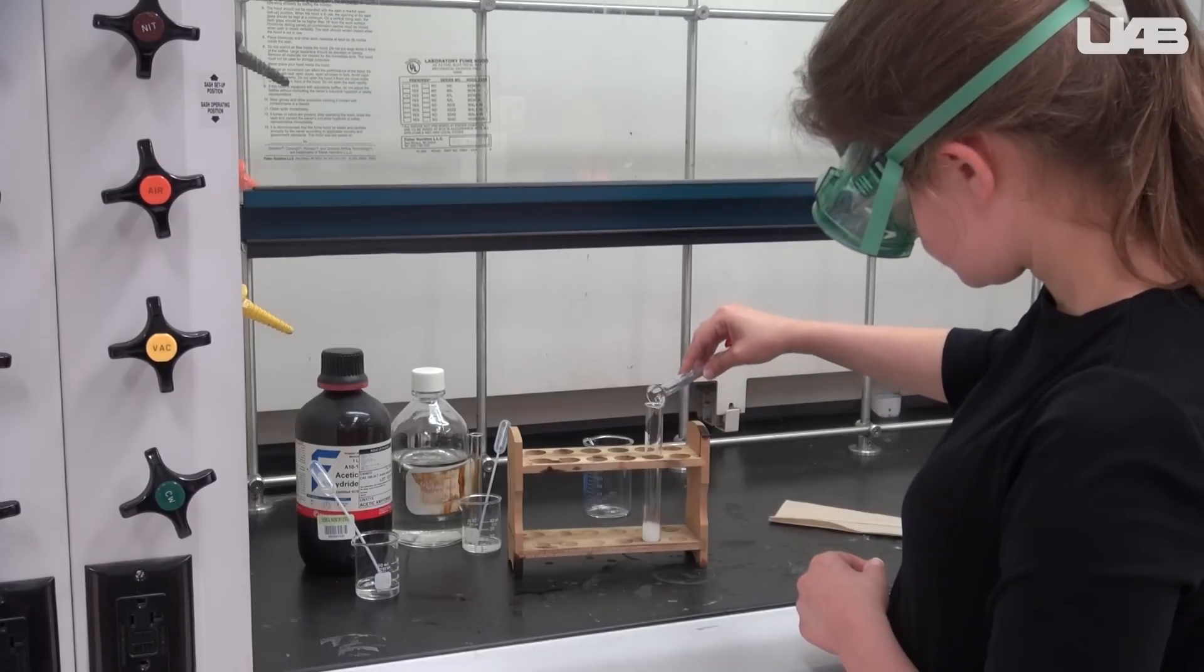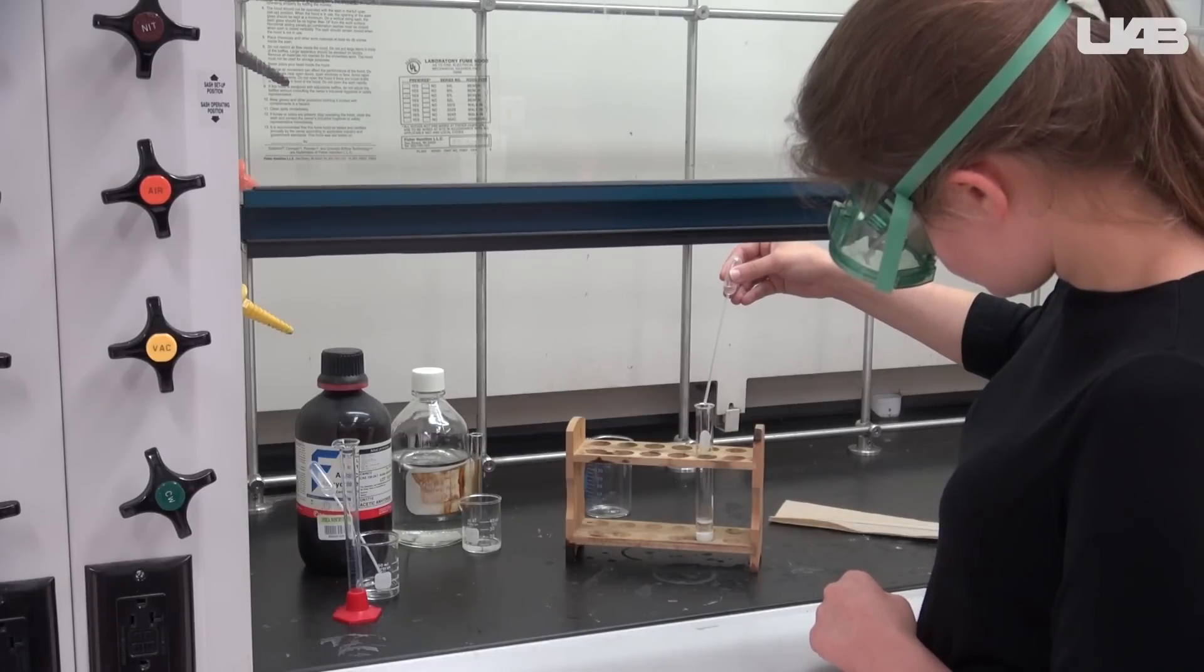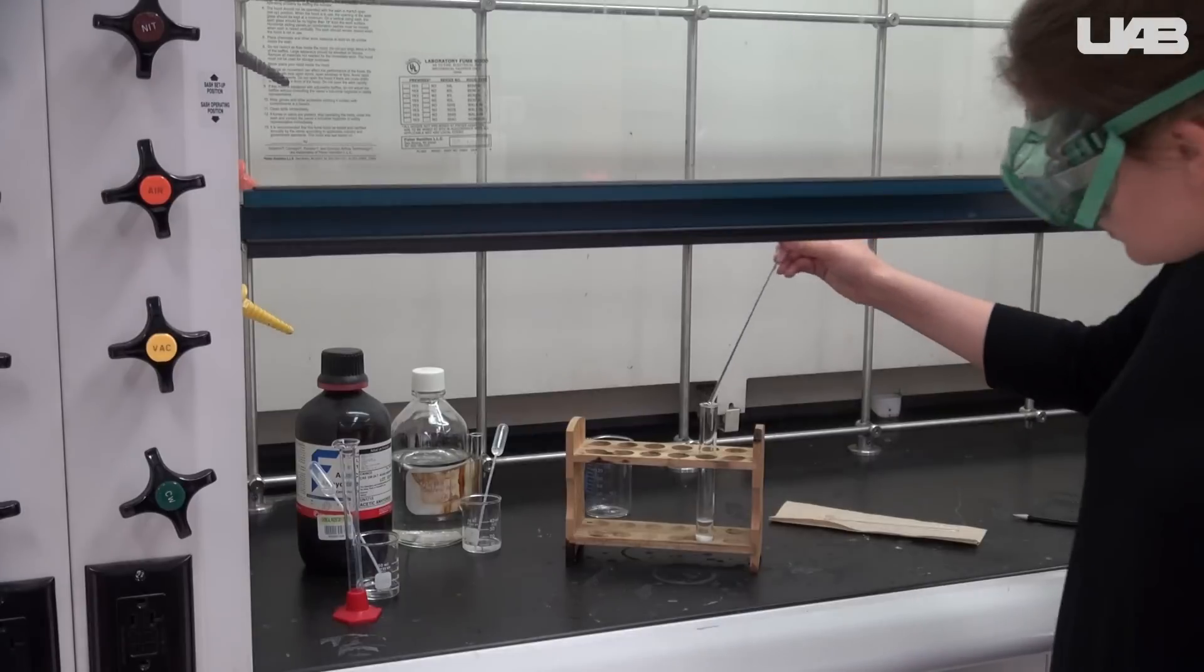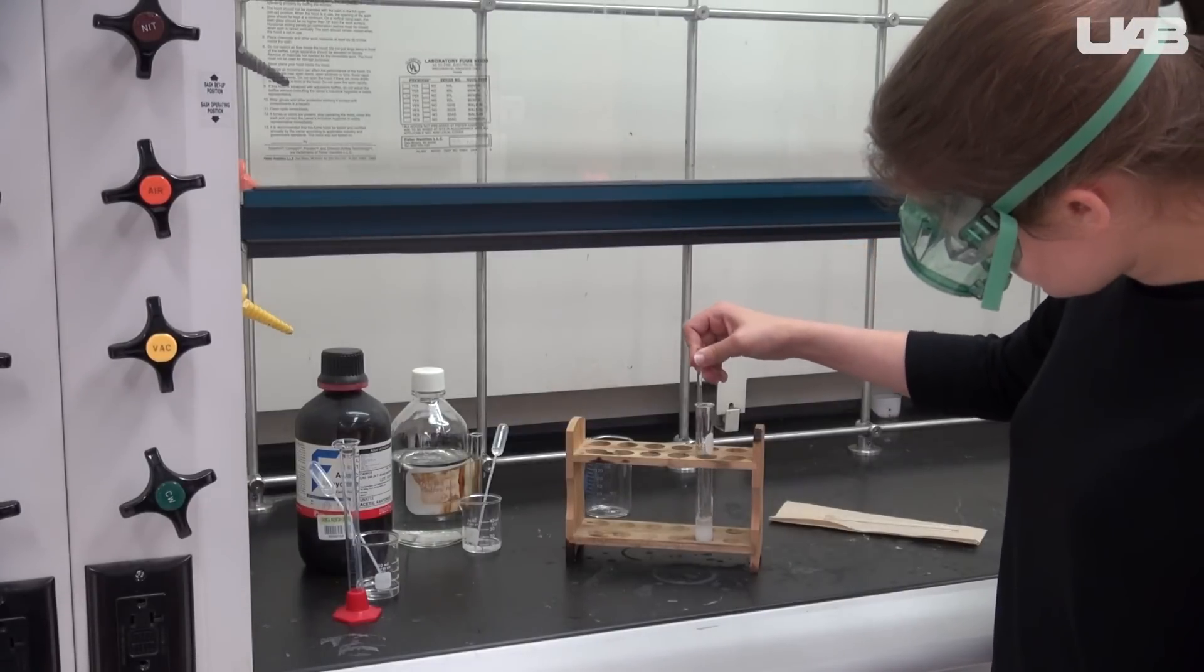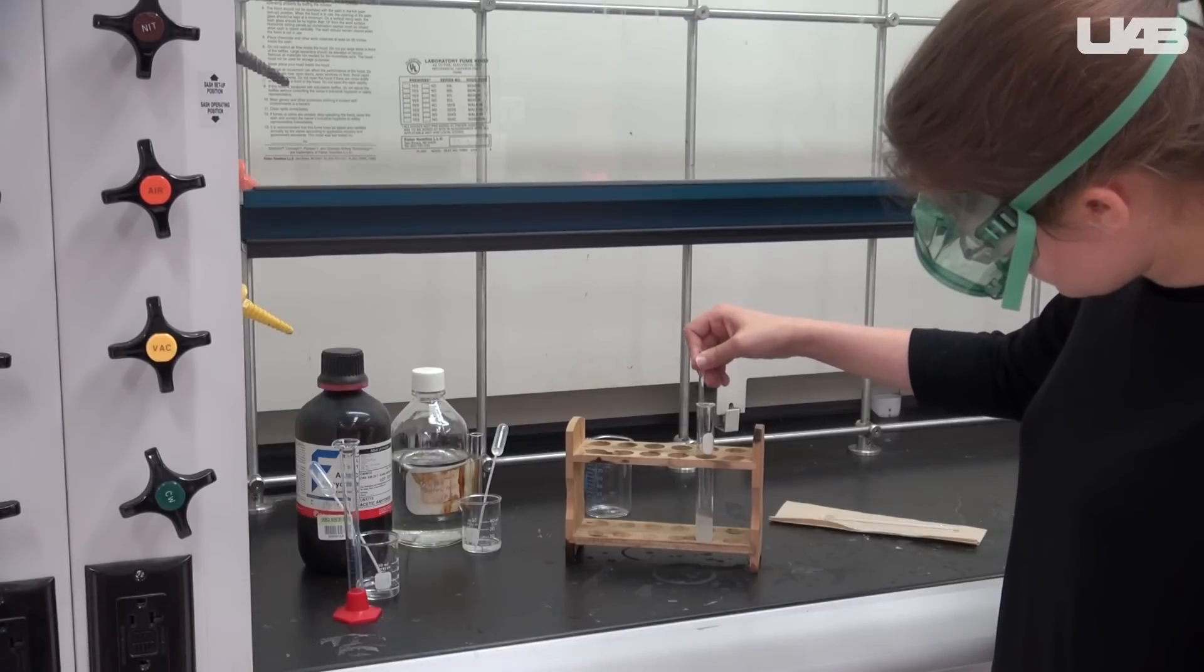Pour it into the test tube with the salicylic acid and add three or four drops of sulfuric acid. Then use a glass rod to mix it. It should slowly go from cloudy to clear as everything goes into solution.